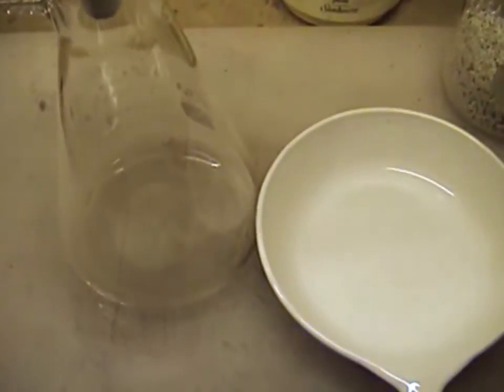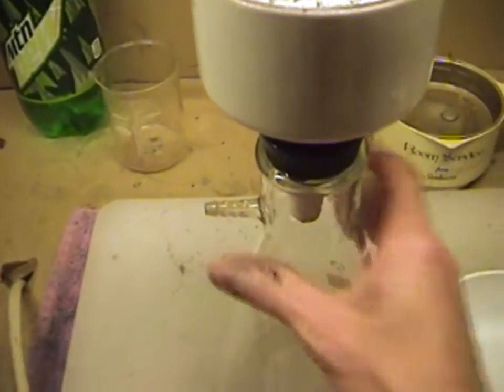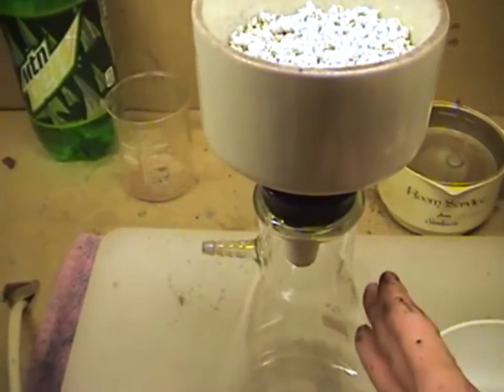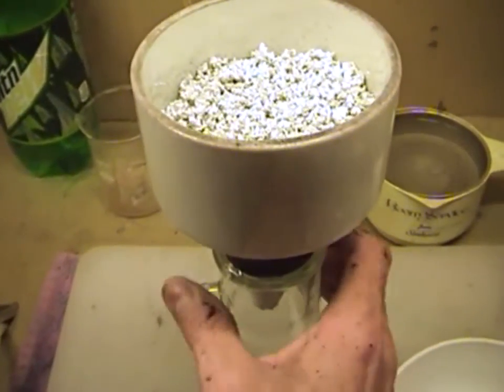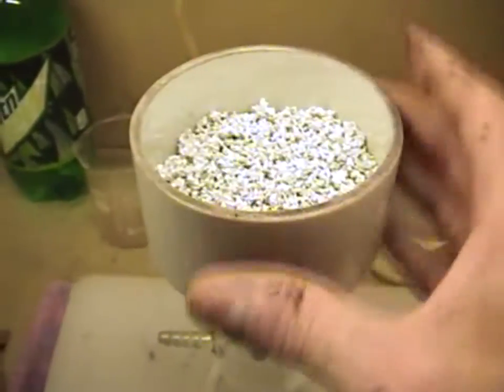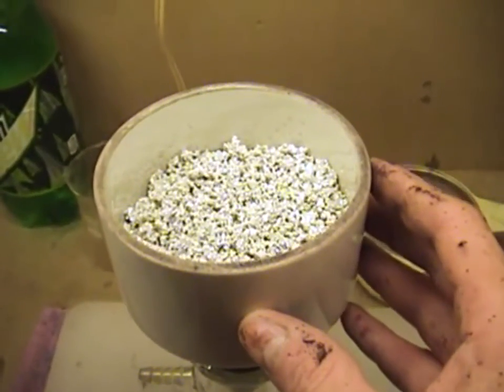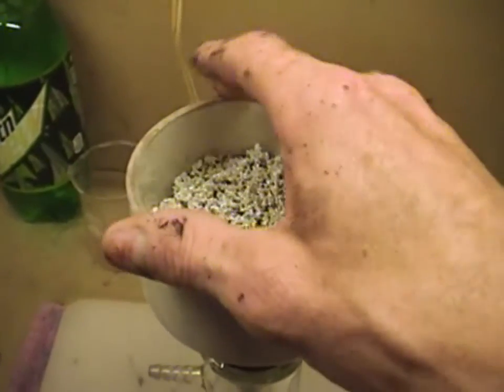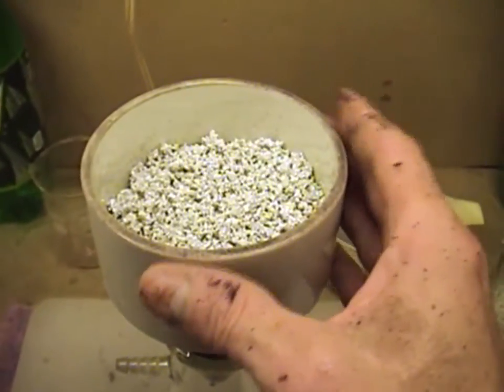If we apply vacuum at this point, all we're going to do is suck the water through so quickly that it won't have time to wash the crystals. So we're going to leave our vacuum off and pour the water in the top of our funnel, allowing our crystals to sit in that hot water. The hotter the water, the more soluble any copper nitrate solution clinging to these crystals is going to be.